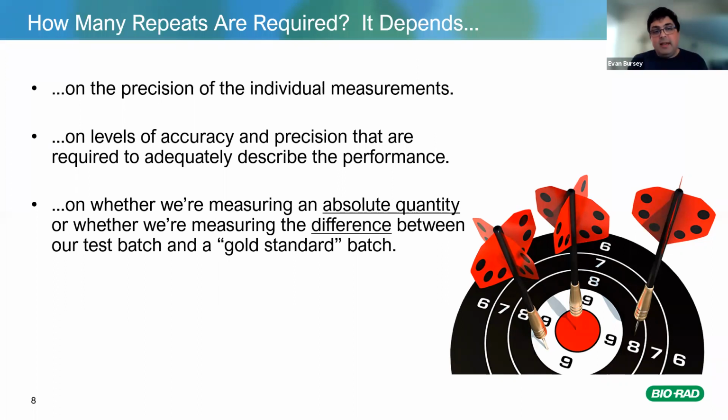So when we think about how many repeats, we spend a fair amount of time thinking about what kind of levels of accuracy and precision we need, what kinds of measurements we are making, and then of course the precision in the individual measurements.